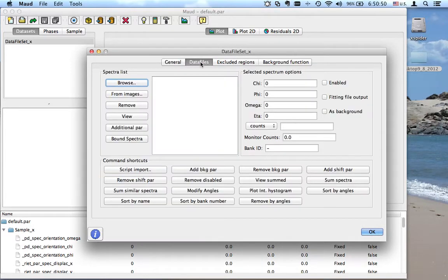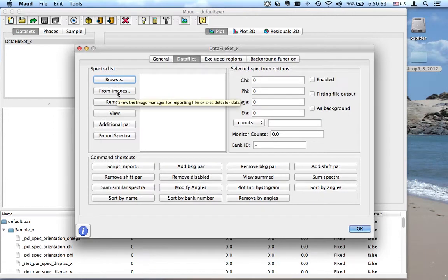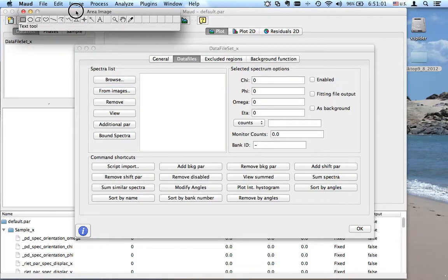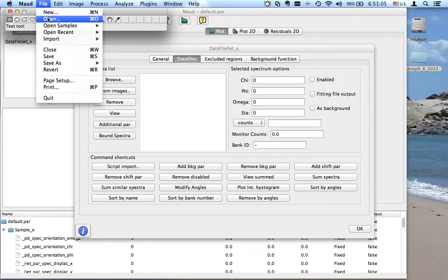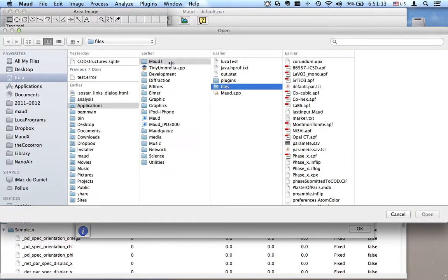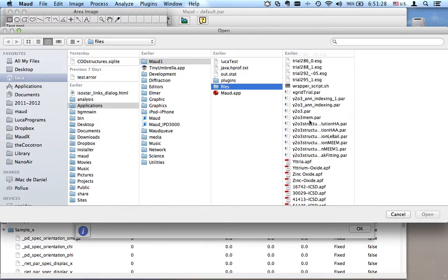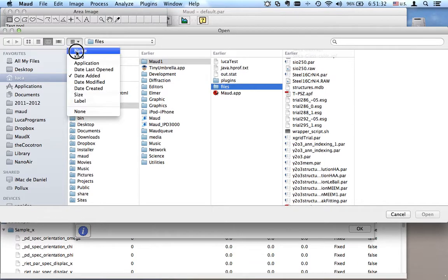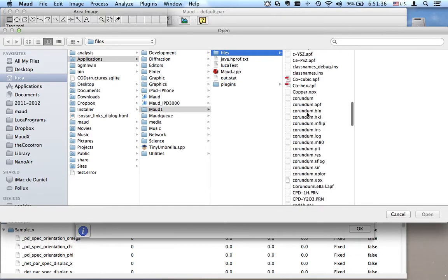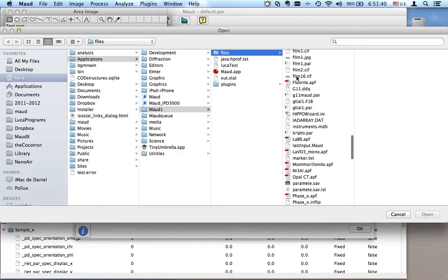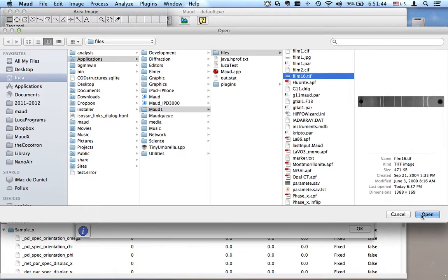We go to the data file, and here we have our image manager — so from image. Here starts the image manager, as I said in the other tutorial, with image A. We load our image. I have my image in my installation folder where I extracted it the first time I was running. Let's go down and find the file. It's called film 16. This is the image I need.